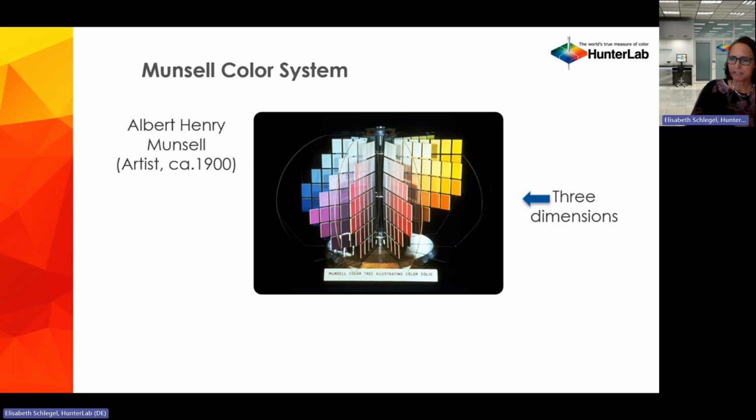So we have the 3 dimensions. And what you can see here already also, it's not a spherical shape. For example, here it's going a little bit more out. So for the light yellow and greenish colors, we have more perception than, for example, for the light blue parts of the color space.